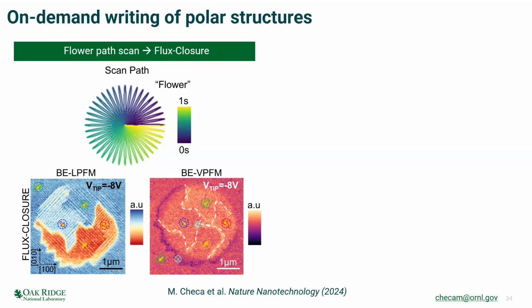So we hypothesize that the polarization goes up because I tried conductive AFM and I didn't get any current out of it. So one could think that it's charging. And we also did phase field modeling, and the phase field showed that if that's the structure that you have, it would relax towards out of plane. So we hypothesized that on those boundaries it is out of plane. We didn't do the simulations for this case, because here you have some sort of weird state, kind of side to head.